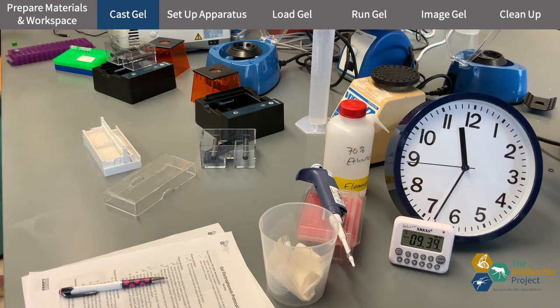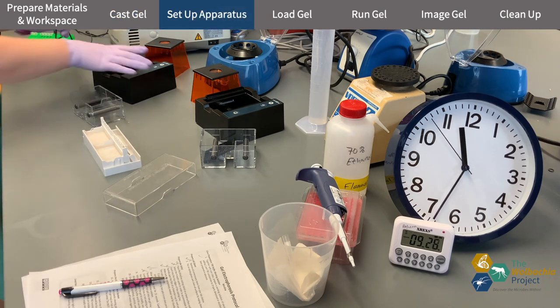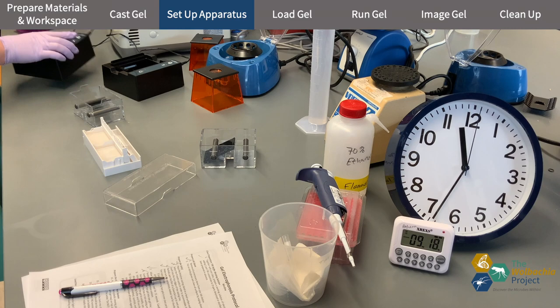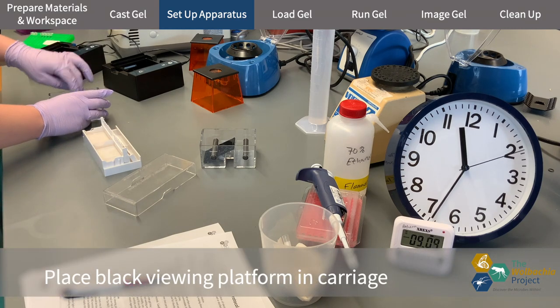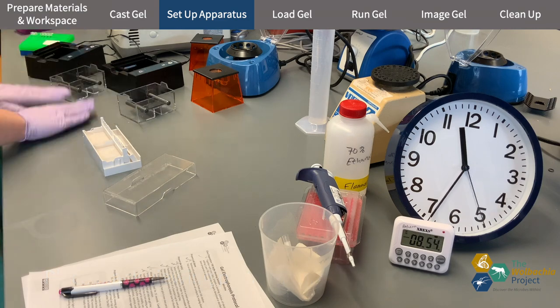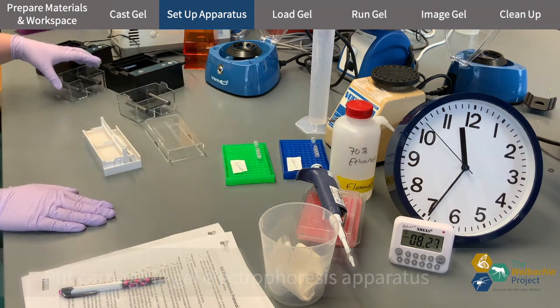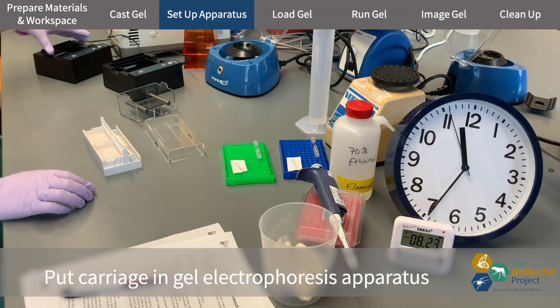In the meantime I'm going to get the gel electrophoresis apparatus set up. I put this black piece of plastic into the viewing platform in the buffer tank. This makes it easier to see the gel while it's running. Then I drop the buffer tank into the carriage.